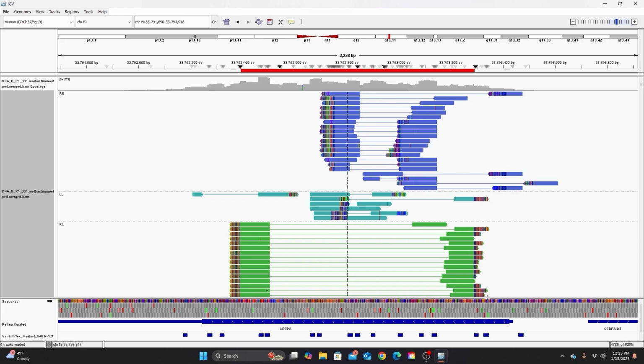You might question, is that really important to do? Are you just interested in whether this gene is still functioning properly, or are you interested in exactly what event took place? At the end of this tutorial, we are not going to know the exact sequence of the structural variant. We're just going to explore some of the things that are going on here.